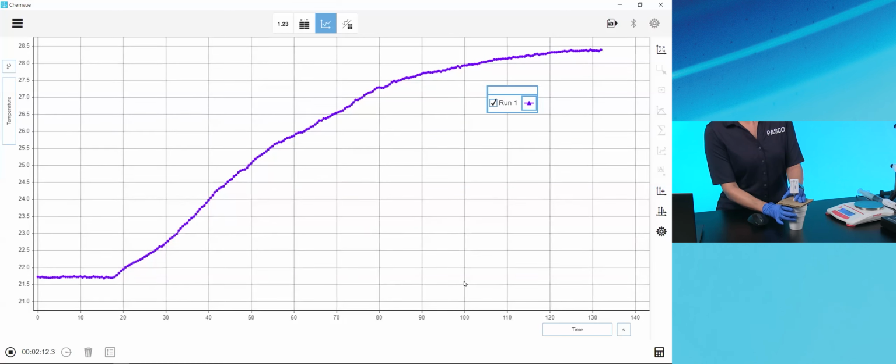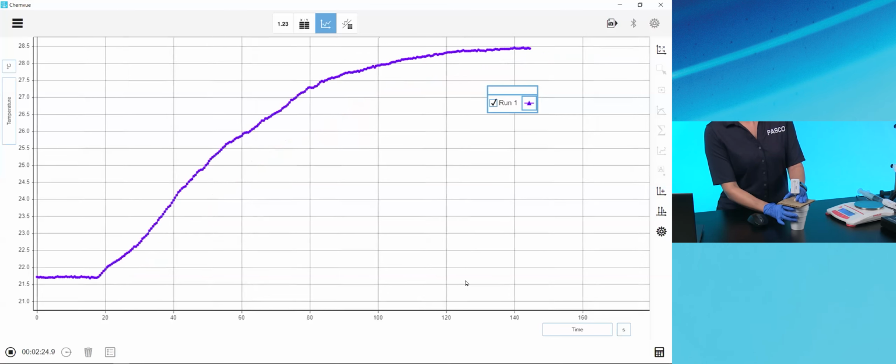It might be there. We have some tools that can help us figure out what was the maximum temp. And I'm guessing it's still going up. So I'm going to keep letting it go. I've got my eye on the x-axis. And it looks like it's flattening out, so we might have reached the peak. And once I'm sure that there's a decrease in temperature, I'm just going to add 60 seconds more to the run time.